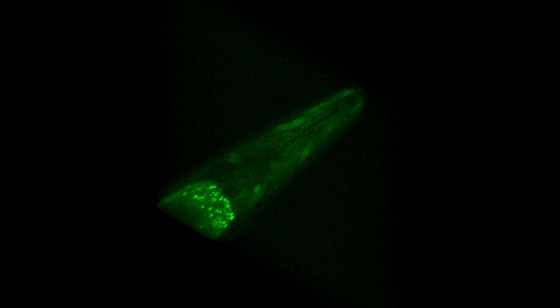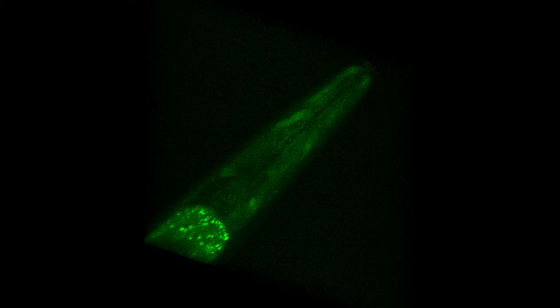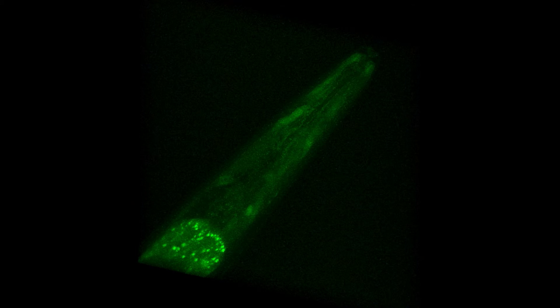Now we move on to a video of the worm. This is the head of the round worm, and we're looking at neuronal sheath cells.